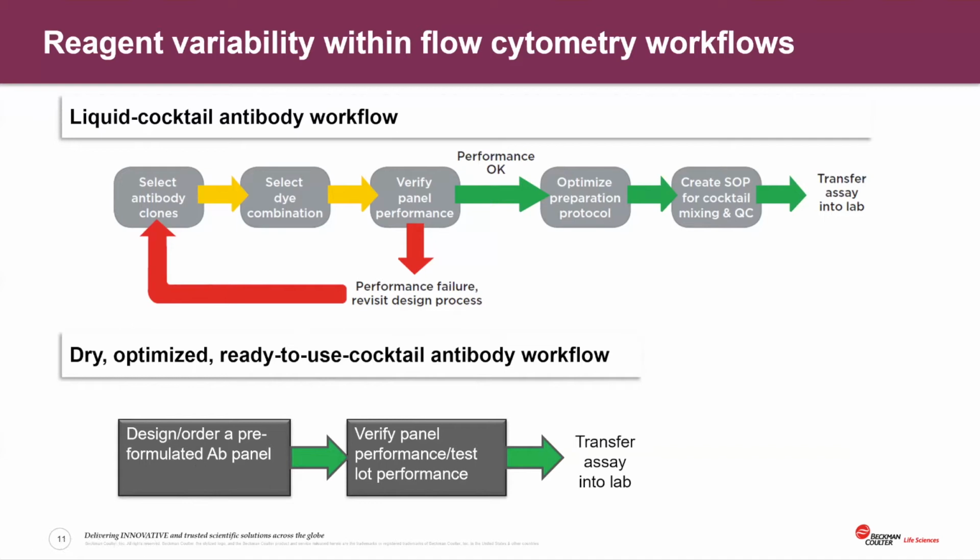And all they require you to do is order them in, validate the panel performance and test the lot itself, and then transfer the assay into the lab. So collectively, these panels eliminate the titration, the panel design, and the actual antibody validation, because all these aspects have already been done for you.